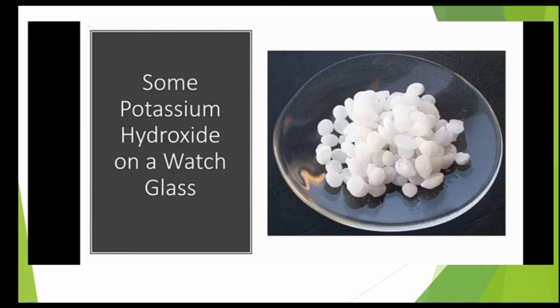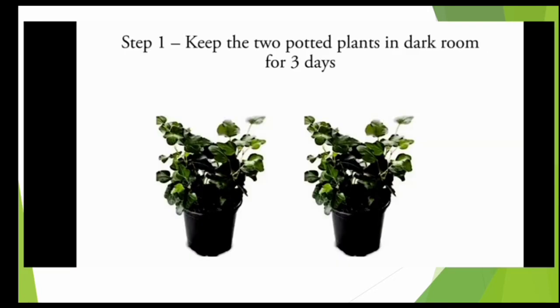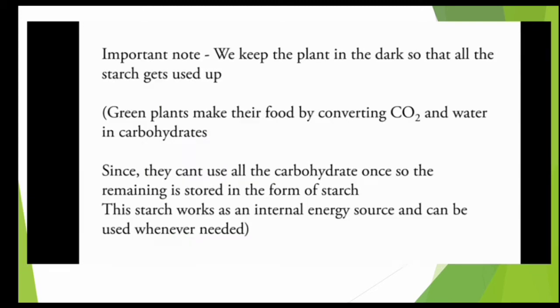To perform this activity, step 1: keep the two potted plants in a dark room for 2 to 3 days. The important note to keep in mind is that we keep the plant in the dark so that all the starch gets used up.